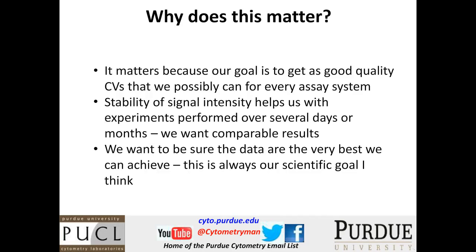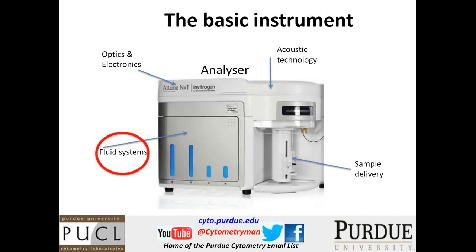So if you want to be sure that the data are the best, you should strive to calibrate your system and make sure that you keep all of these things tuned appropriately. And that's, of course, a scientific goal that I think everybody has.